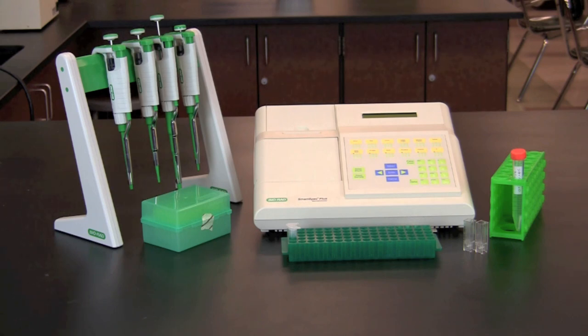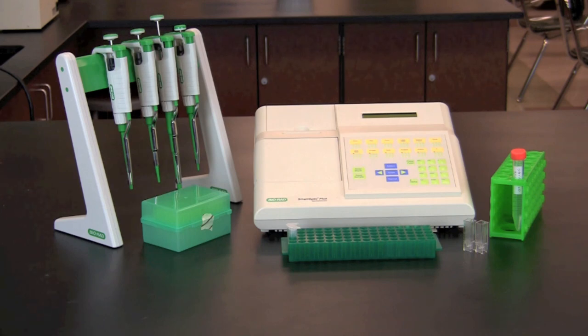Approximately 10 minutes before starting the experiment, turn on the spectrophotometer so that it has time to warm up.